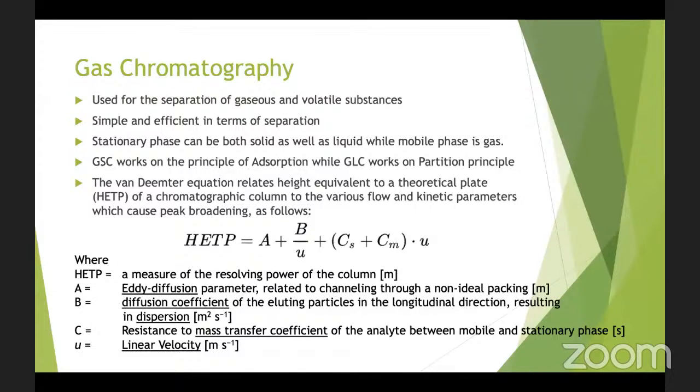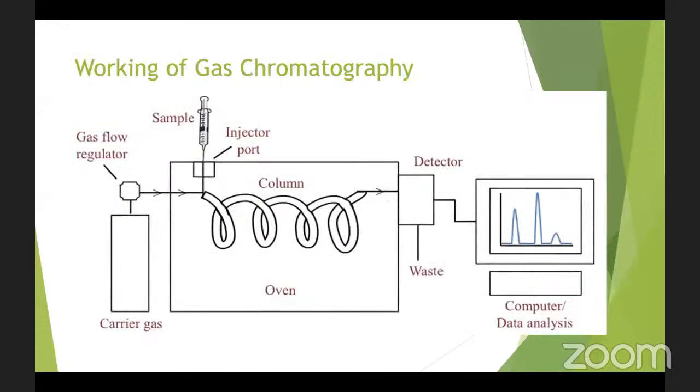So then we move on to the working of the gas chromatography. Gas chromatography, basically, as you can see, is my cursor? Yes, you can see my cursor, right? So this is the gas chamber, and in this, gas is used as a mobile phase, and it is stored in a gas chamber. So this is the gas chamber in which this gas is stored.